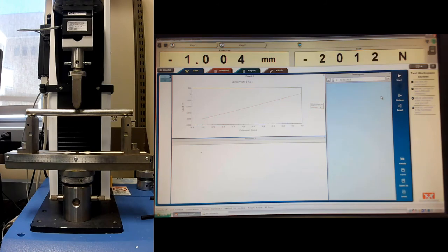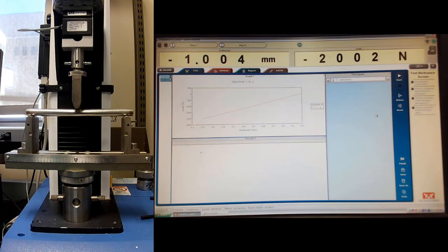Okay, we're done. That worked well. Again, I would check and make sure that this data is output in CSV format. And so I've already done that and it works. So we're good here.